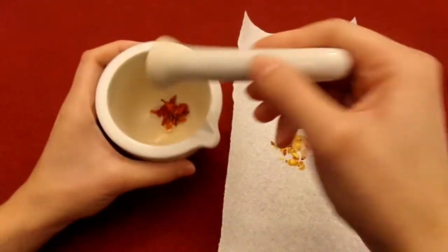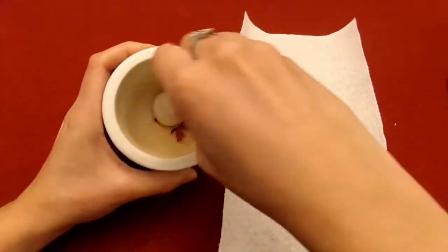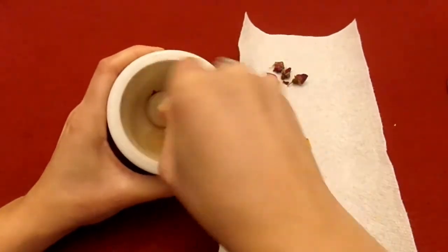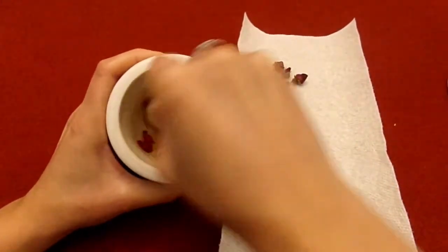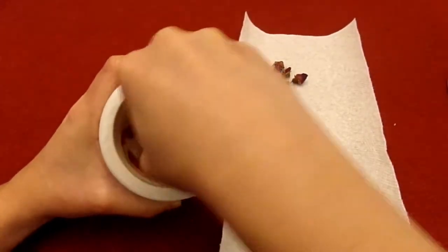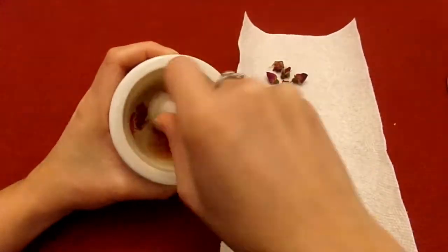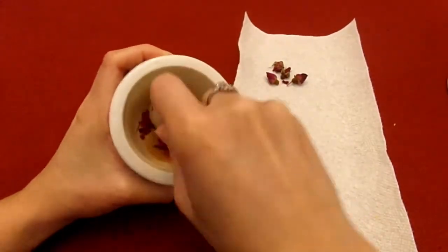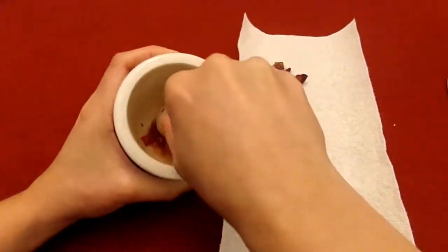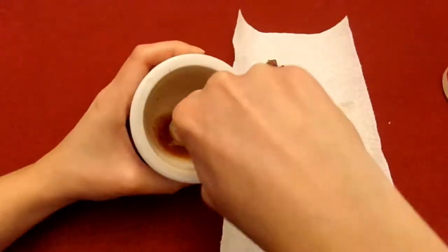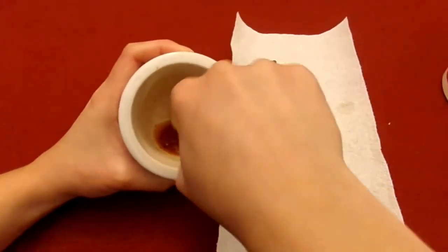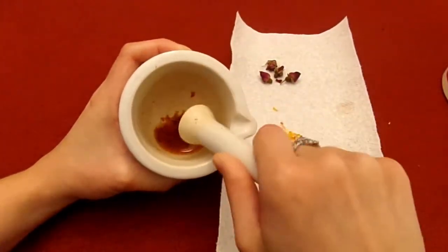Then take your pestle and start grinding the flowers. Make sure you use a good amount of force to really crush up the flowers. Spend at least a few minutes crushing up the petals and the acetone should have taken on a bright color.